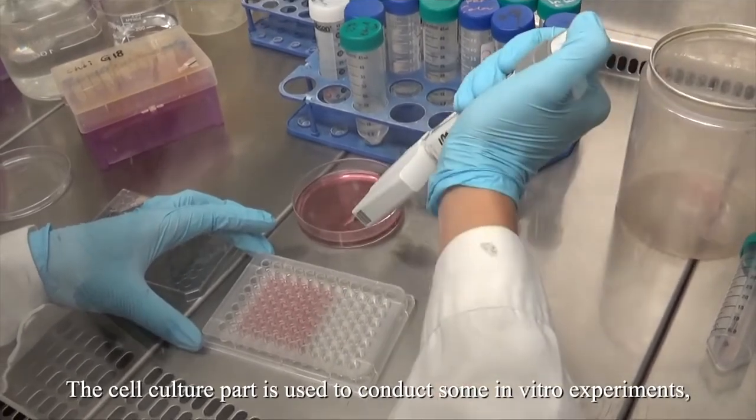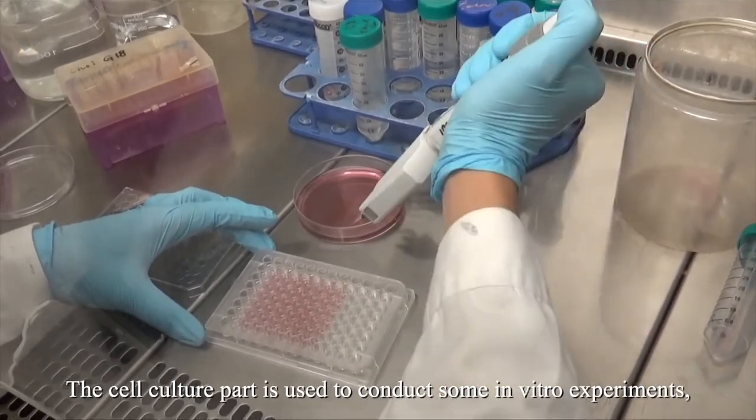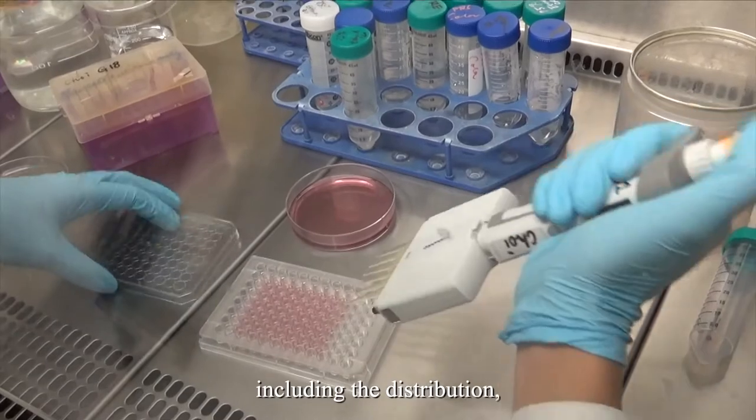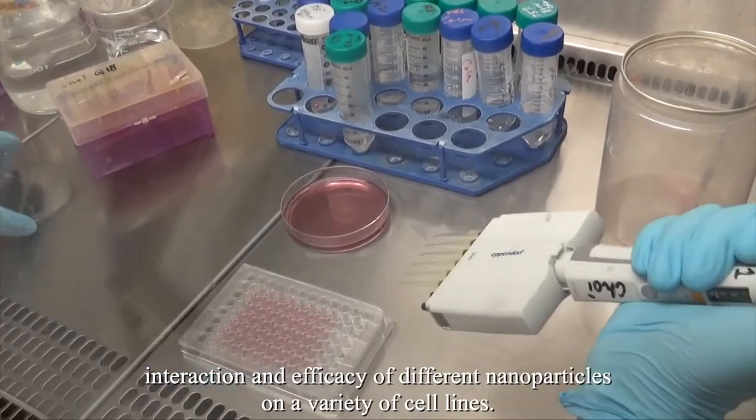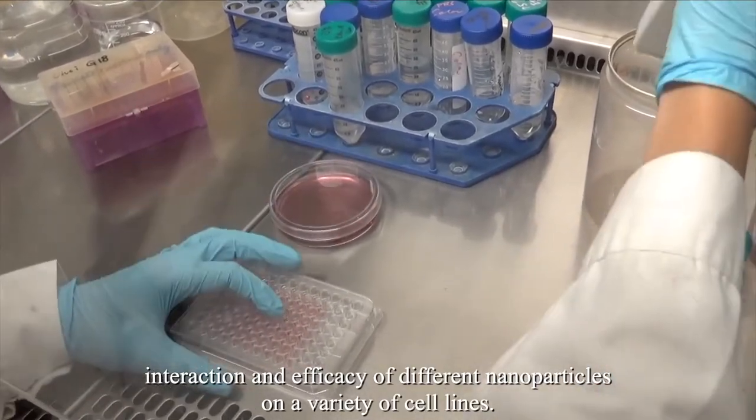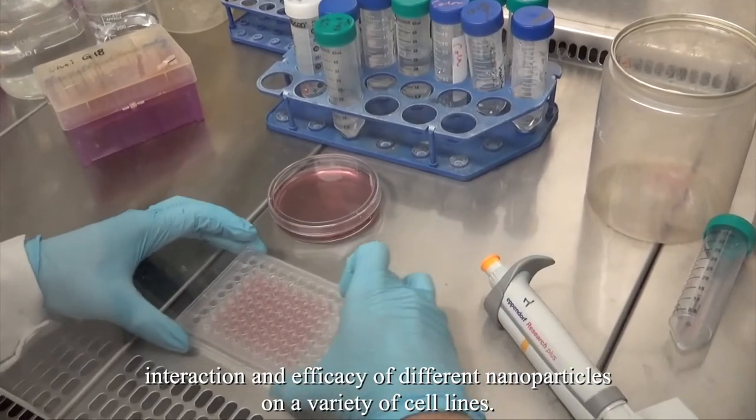The cell culture part is used to conduct in vitro experiments, including distribution, interaction, and efficacy of different nanoparticles on a variety of cell lines.